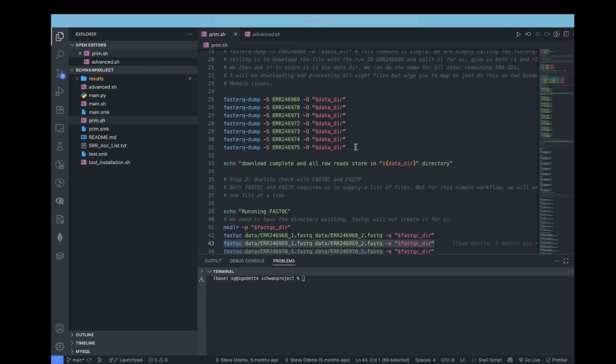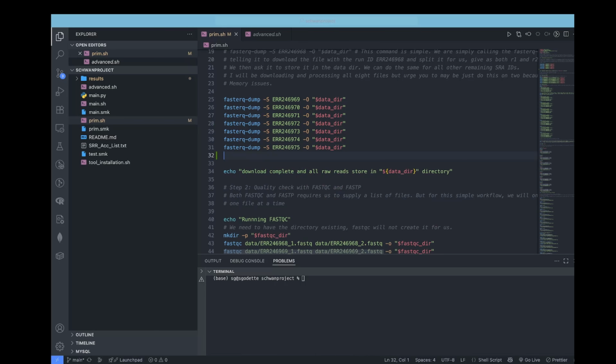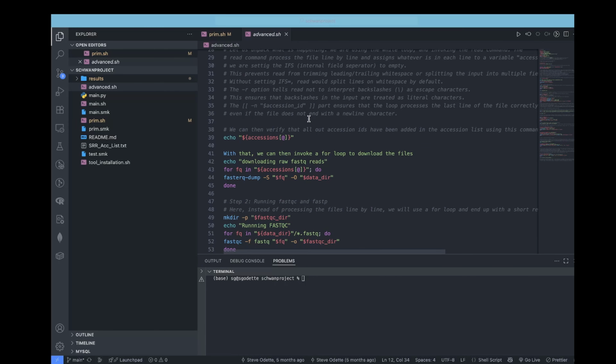It will mean then that you have a lot of lines of code like this. So this can sometimes be challenging because you can make mistakes and the process will not be reproducible. With a pipeline, for example, what we have here, you can supply this pipeline with any amount of data and it will process it with the same functionalities, the same settings for every single file.